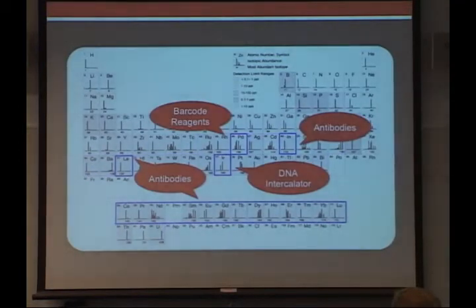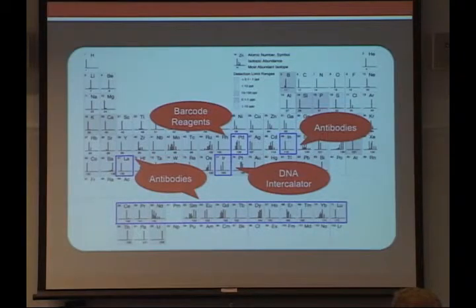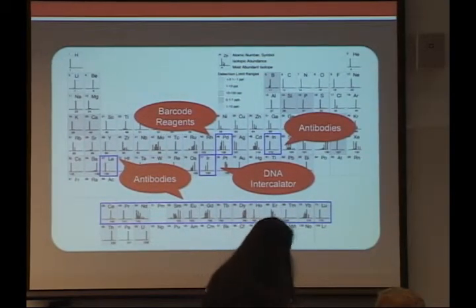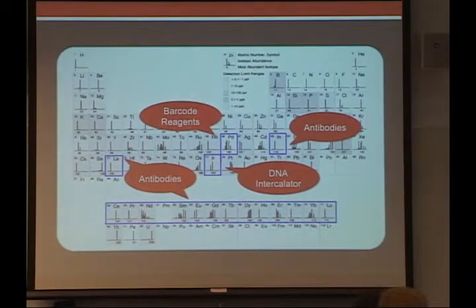So where do we actually stand? What's in use day to day in our lab and elsewhere? Well, antibodies, you'll see, are largely reliant on the lanthanide series, which, as you all know from your introductory chemistry, is part of that little table at the bottom. Always wondered what it was good for. Well, here's what it's good for. And an additional indium.